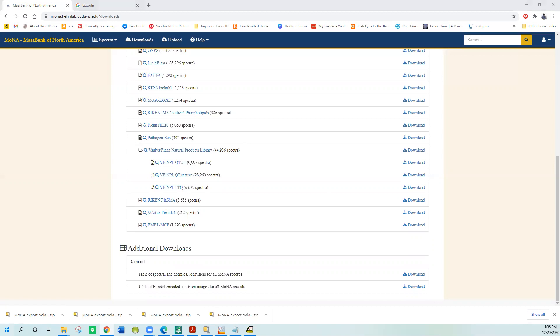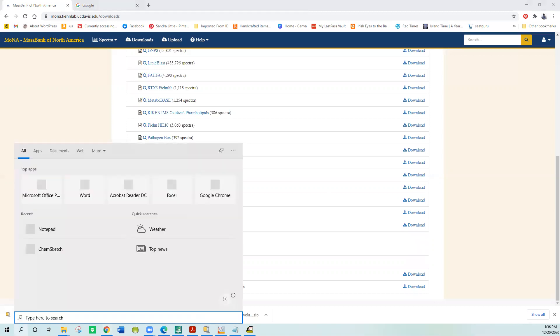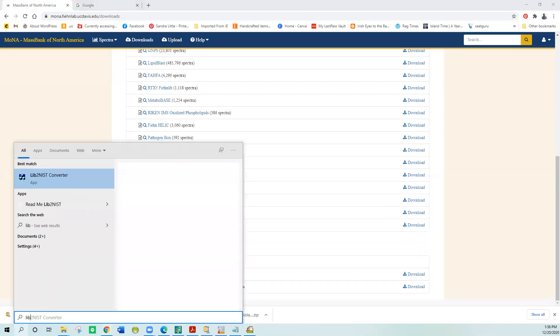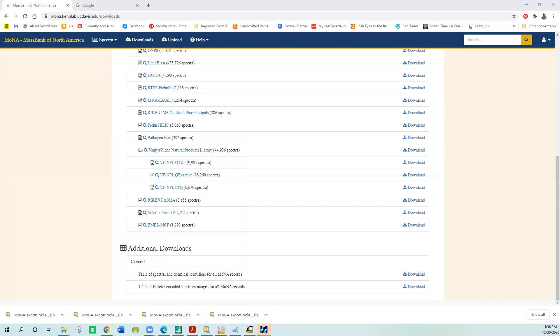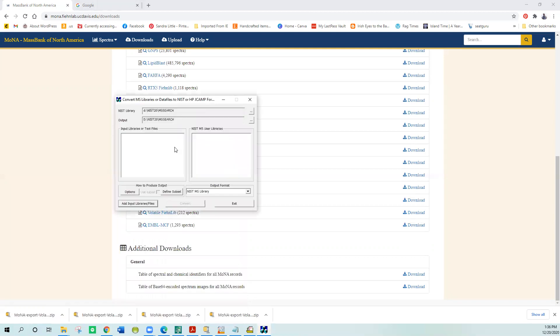Then you have to open Lib to NIST. Let's just find it, Lib to NIST converter. It's a utility that NIST makes for doing these conversions. You need to first set up the options and the options are in the handout. Anytime you do anything in this, you have to set up some options, so it's best you read the detailed material if you want to actually do this process. I'll show you the basic ones.